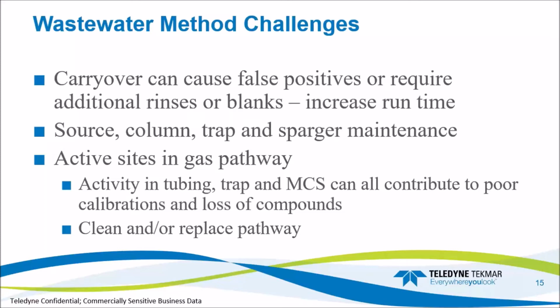Wastewater samples tend to be a more complex matrix, like a combination of solids or particulates and volatile compounds, which we're interested in, but also some could be semi-volatile compounds. And that could be in the sample, and that can build up over time in the gas pathway as they are purged out of solution and then deposited inside of the purge and trap system.